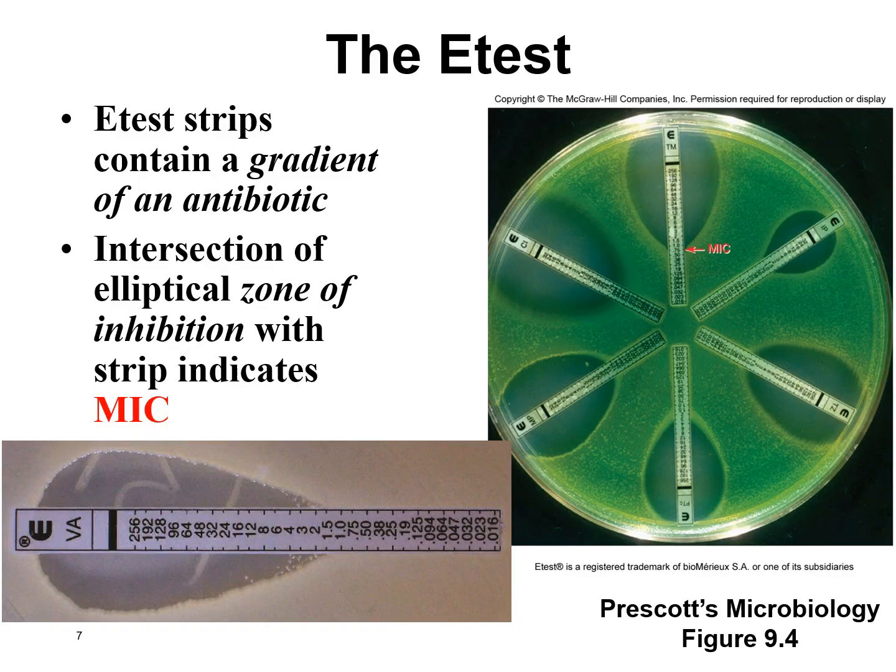Another way to determine the MIC for an antibiotic is to do the ETest. So we'll take the bacteria from the patient's culture sample, put that onto a petri dish, and we'll put these ETest strips on the dish and grow that for 24 hours, come back. The antibiotic will diffuse out from the test strip and then kill the bacteria, and you'll get the zone of inhibition, this clear area. The test strip has different levels of antibiotic, and you can see that marked on this test strip on the bottom for vancomycin.